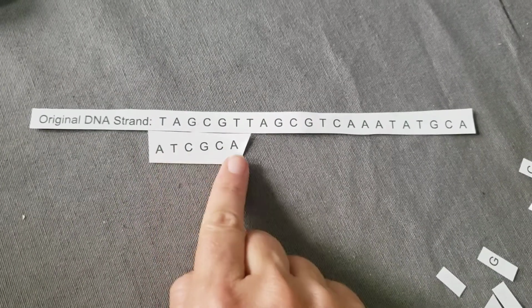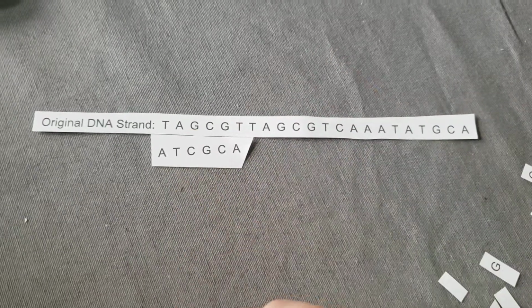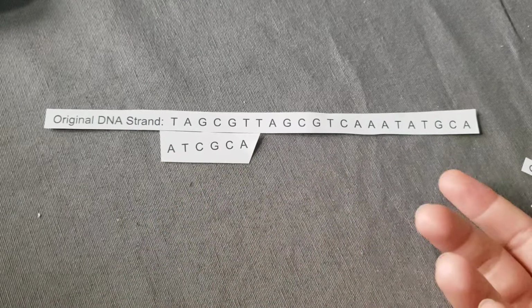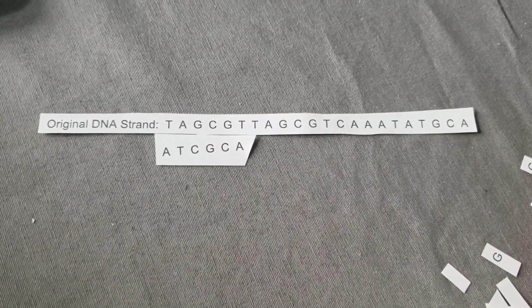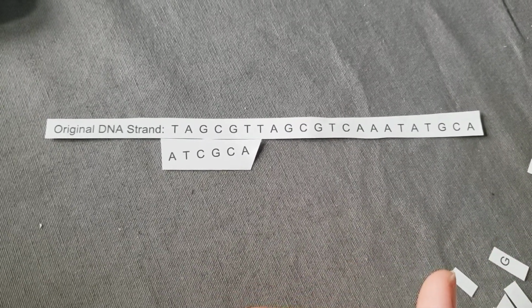We've attached primers at the lower temperature. They theoretically are attaching inside of a little tube in a machine. And if all goes well, we're going to have successful copies of that DNA made. Later, we're going to read that DNA and we might find that we get no results.